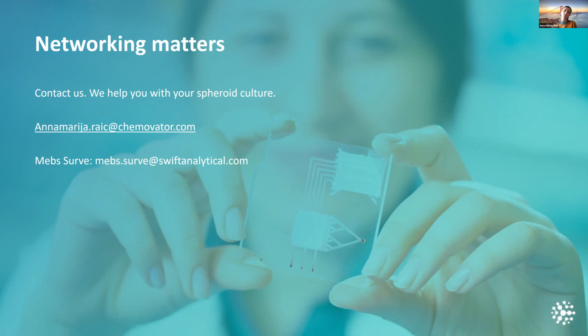But it depends from cell line to cell line. Some cell lines form a dense network, and some cell lines do not form that dense network. So it could happen that the spheroid disrupts during the transfer. Again, another case of try it and see, really. Test application.